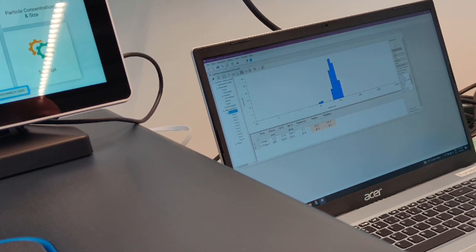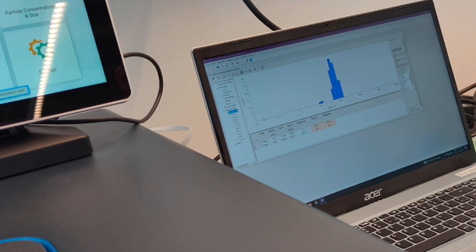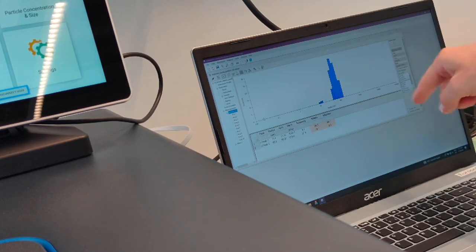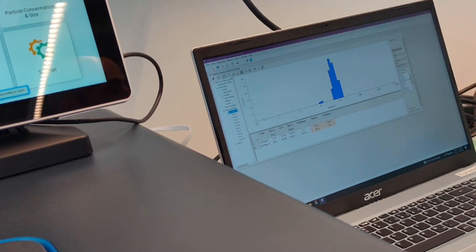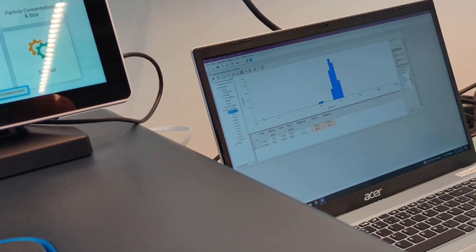This is very good. No, because now you have high quality data — because we can reach the baseline, because we have no particles there. So this is very good.